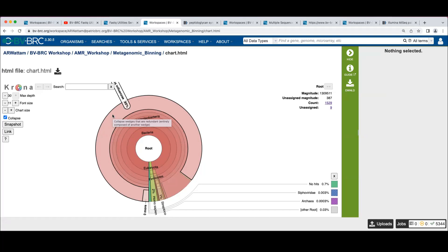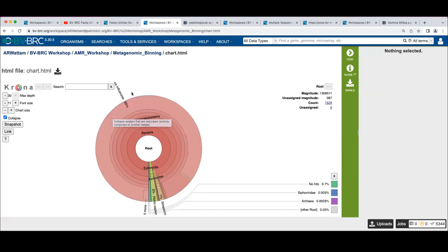It might be interesting to bin this genome and then remap that perhaps and see how they fit and compare the one we pulled out to the references. We'll go through later on how we do that.